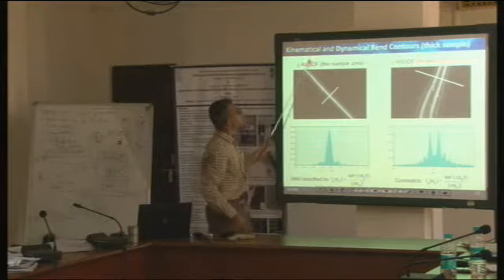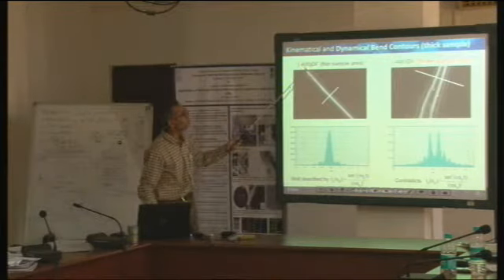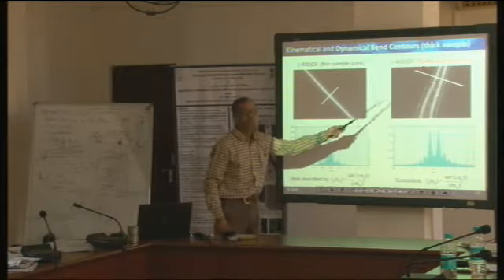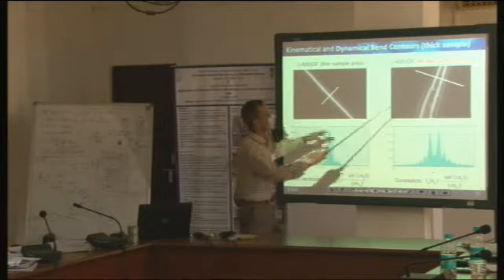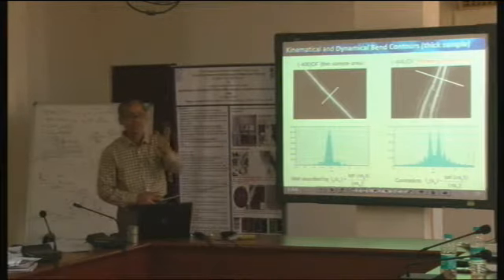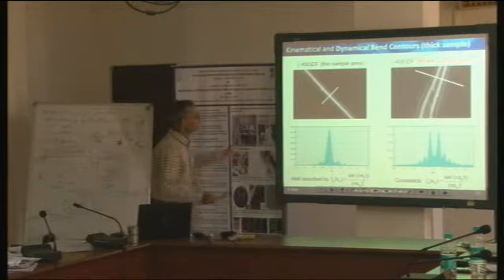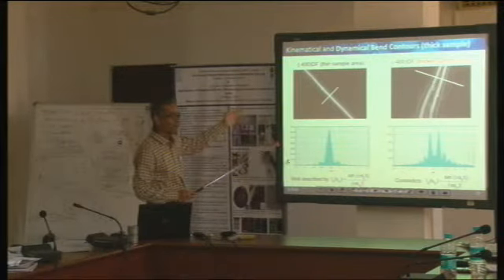And here the same thing is drawn: a dark field image with the 400 reflection, and here also an image with a 400 reflection, but what do you see here? It's probably not the same area, it's a different area, but here we see that in the center there is no maxima, there is a minima. So that's the problem. These are experimental, so these are more valuable. This is the final thing.